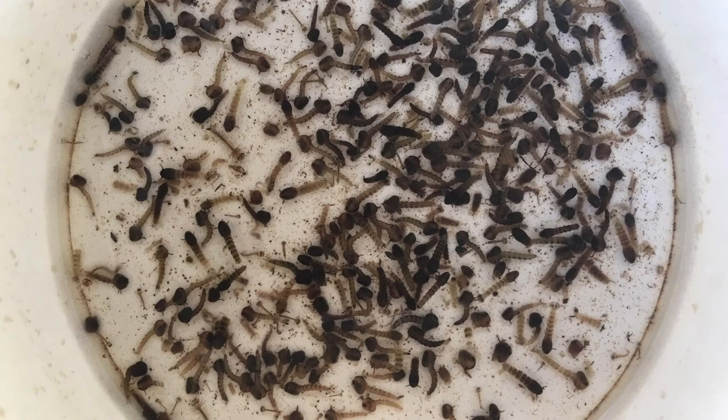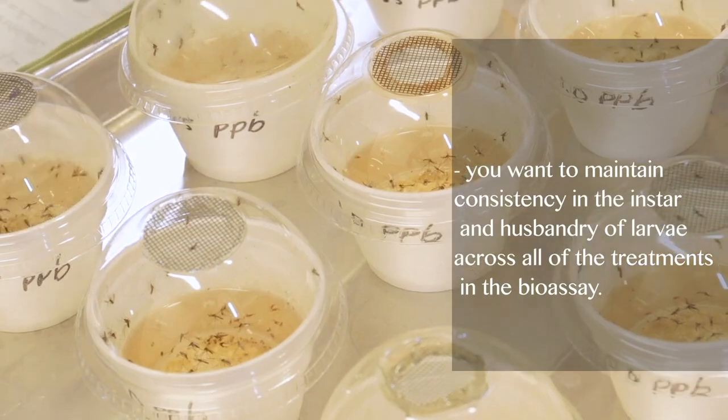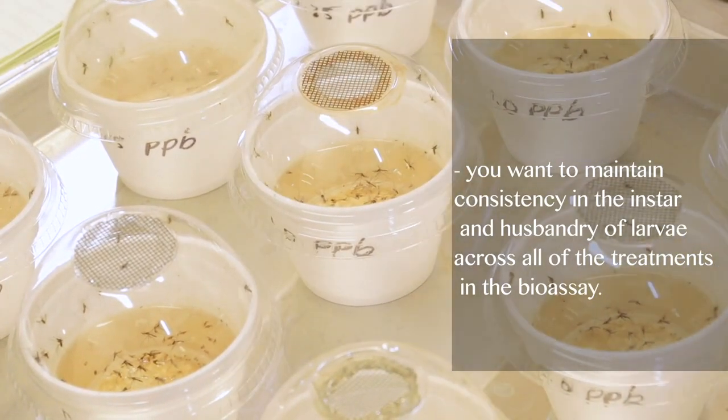Sometimes, younger instars, such as 2nd instars, are used in bioassays. An important point to keep in mind is that you want to maintain consistency in the instar and husbandry of larvae across all treatments in the bioassay.